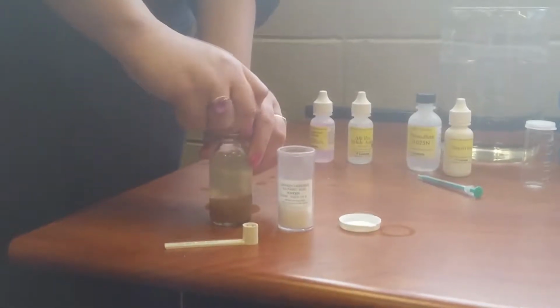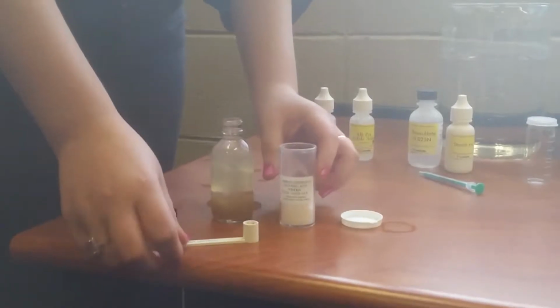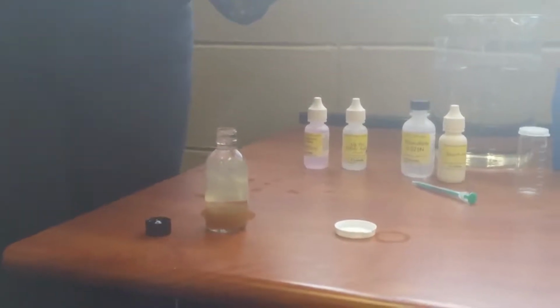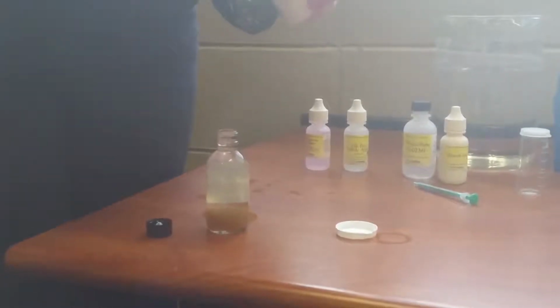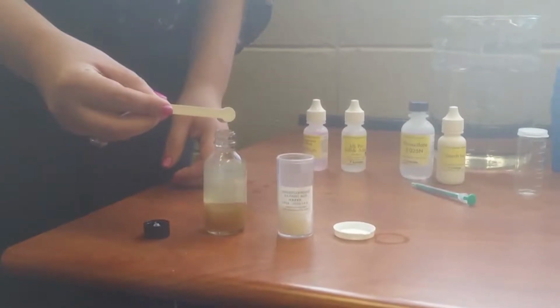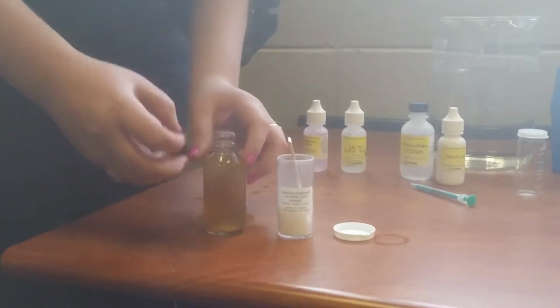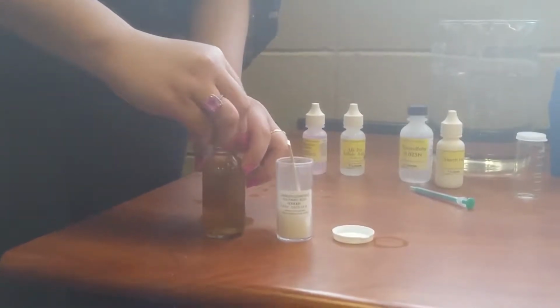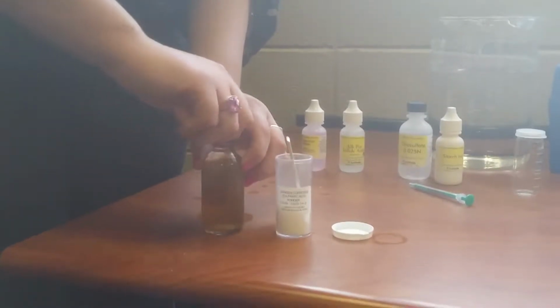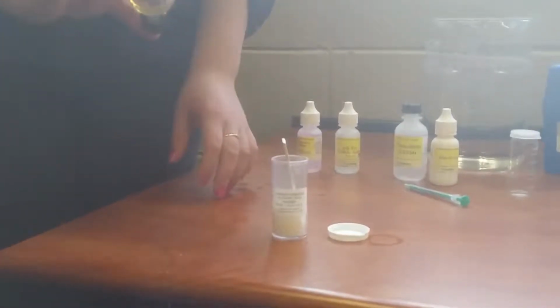Now use a 1 gram spoon and add sulfamic acid powder to the mix. We will then cap the mix. And then mix it. And wait for it to dissolve.